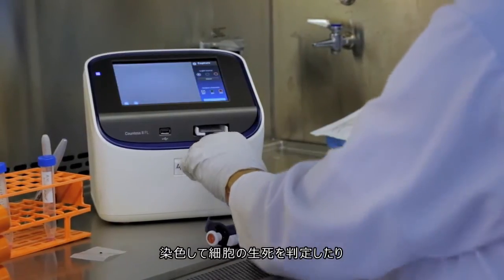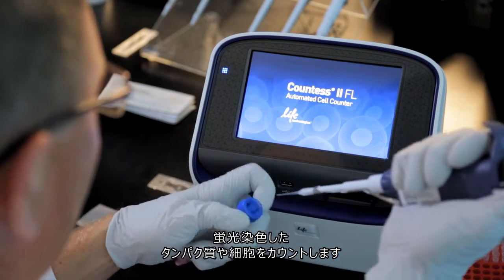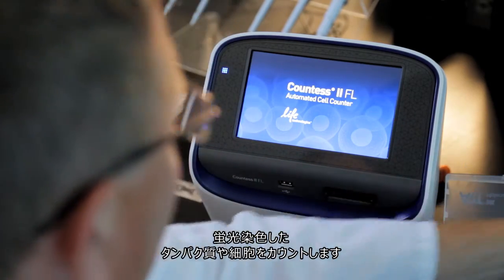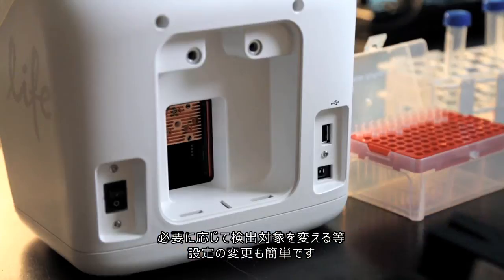Whether determining live and dead cell counts using TripanBlue staining, or counting cells expressing fluorescent proteins or labeled with fluorescent dyes, the Countess2 FL automated cell counter is flexible and configurable.